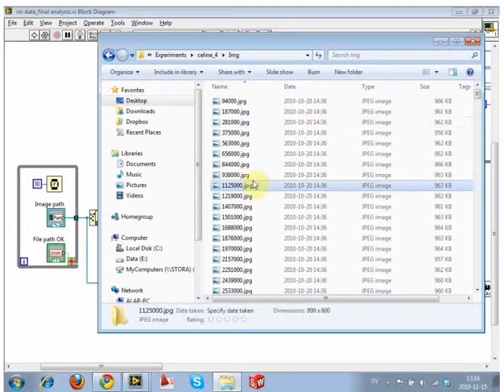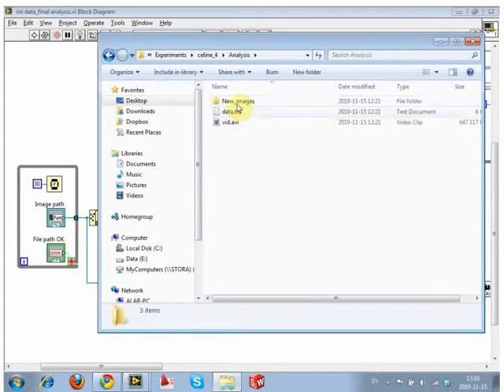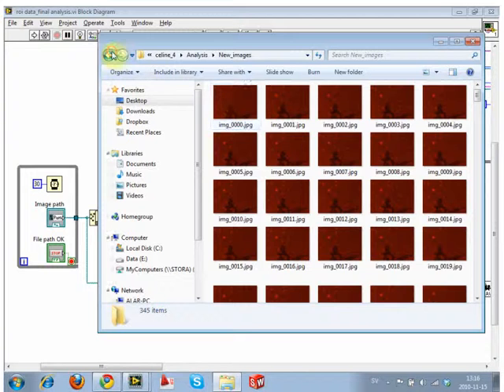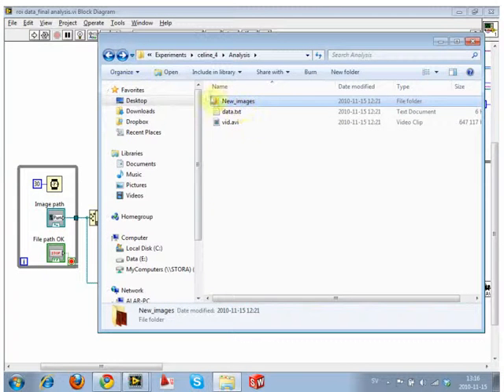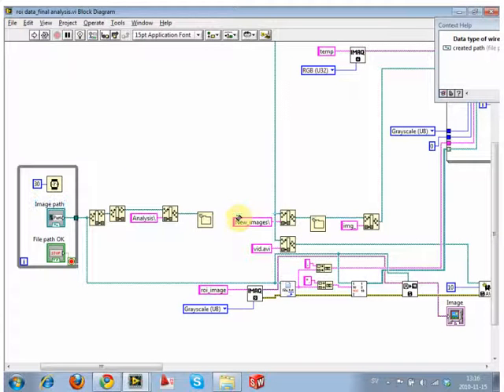so it's much better if we're analyzing in this folder set. We want the program to automatically know: I need to go up one directory to here, I need to make a new folder here, call it this, I need to make a new folder here, put all my images in there. So we need to establish a file structure, and that's all this is doing at the start. It's trying to make it easier, so that every time it wants to save a file, it doesn't ask you where to put it.